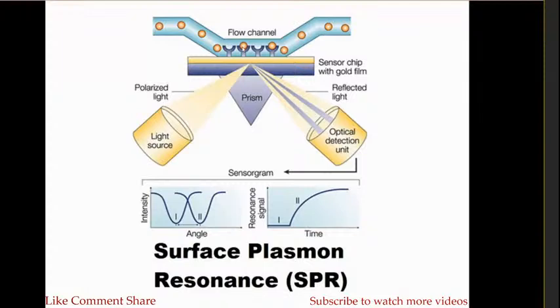Here that blue color means less intensity, and imagine the yellow color means the light rays. Here you pass the light, there is no interaction, no molecule is there, so the light is directly emitted, and is directly received by the detector unit. If there is an interaction, the light is absorbed by the interaction, that is the high density molecule, so we can't receive the light.